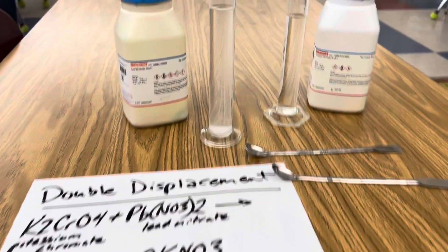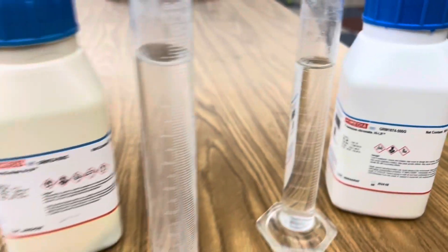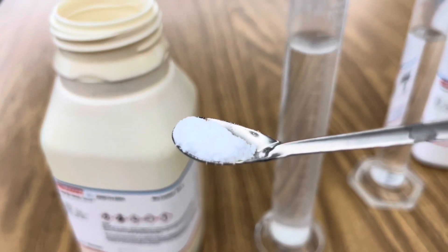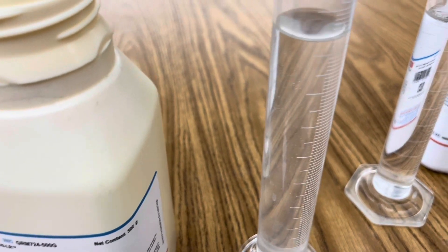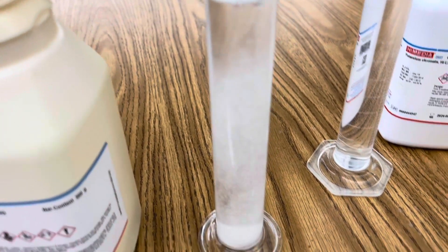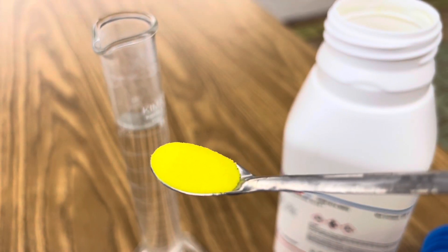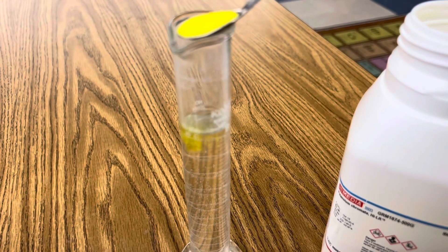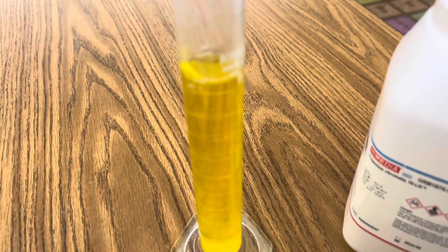In this double displacement reaction, I'm using lead nitrate, potassium chromate, and a couple of graduated cylinders of distilled water. The first step is to add four grams of lead nitrate to your distilled water and make an aqueous solution by dissolving the crystals completely. The second step is to add four grams of potassium chromate to your second graduated cylinder and create an aqueous solution by completely dissolving the crystals.